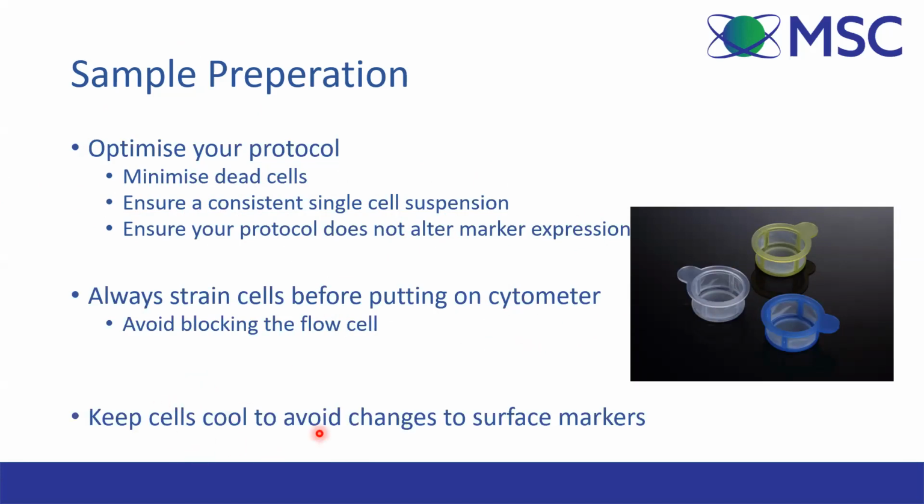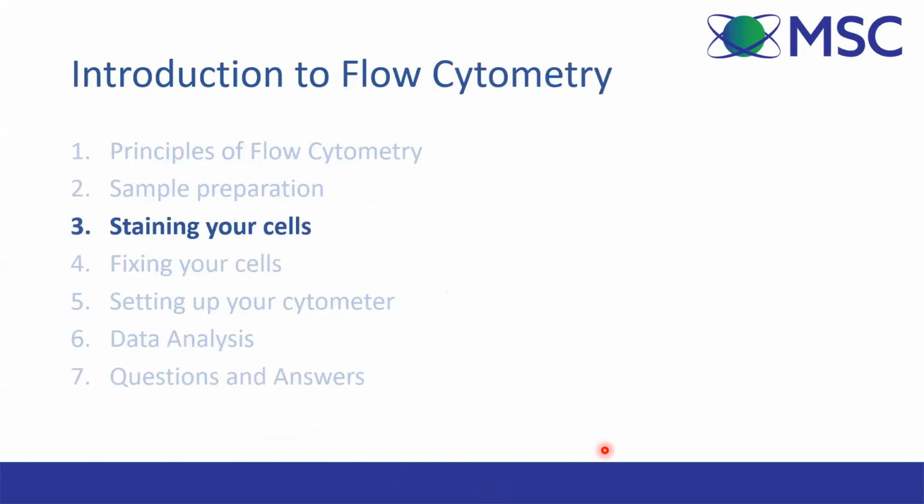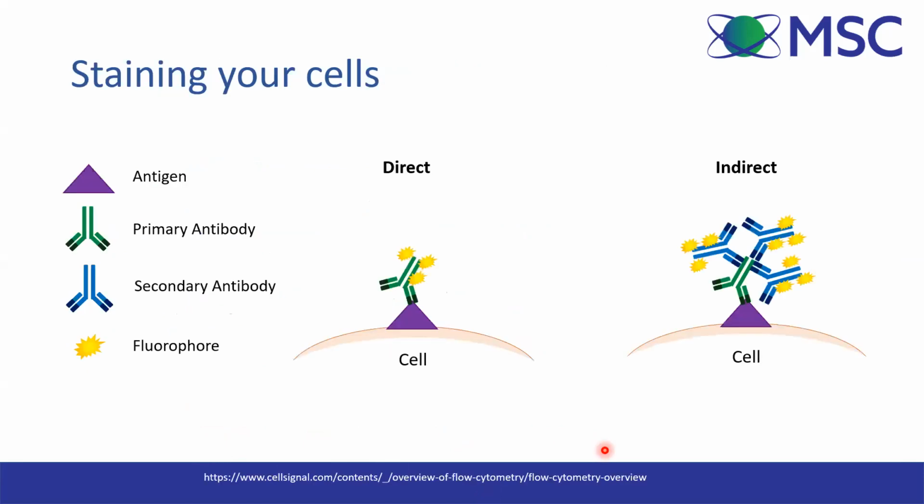And you want to keep your cells cool throughout the preparation process and the staining process, to ensure that you're not changing the marker expression on your cells. So next we'll move on to chat about how you'd stain your cells.